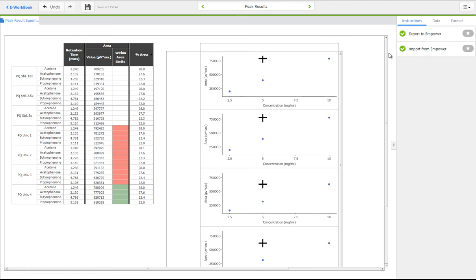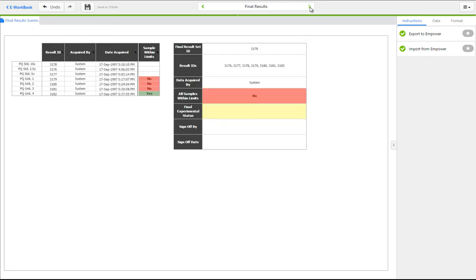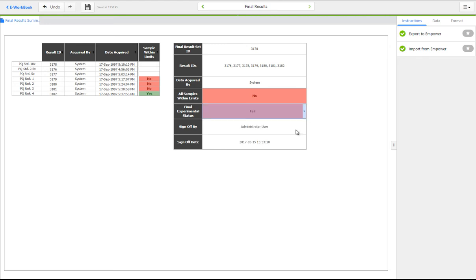The experiment can then be signed off and saved to associate this result data with the sample information in the eWorkbook database and facilitate further reporting on all of this information.